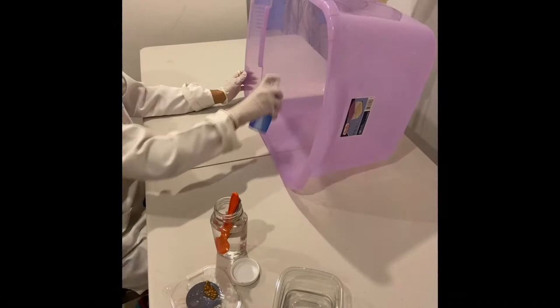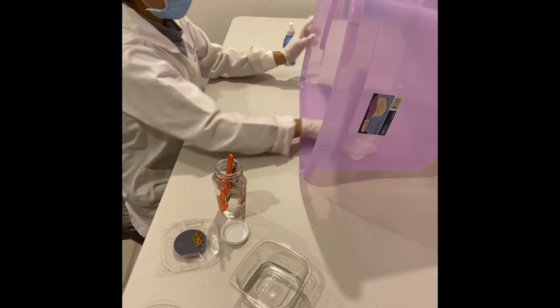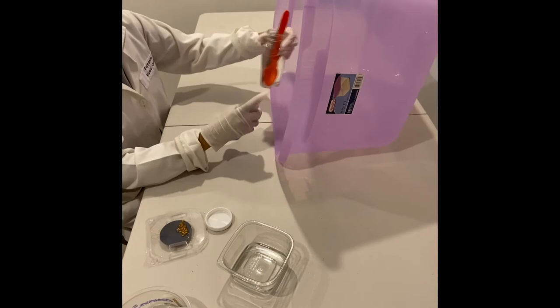The first step was to clean the room. I put a plastic box and a fan in the back of it to simulate a laminar flow cabinet. When working in this space, it is important to wear a coat, face mask, and gloves. I disinfected every material that I put inside the plastic box with 70% ethanol.